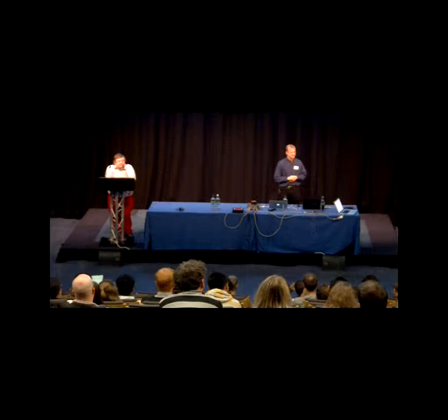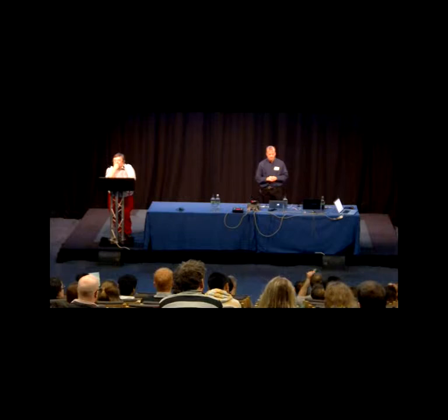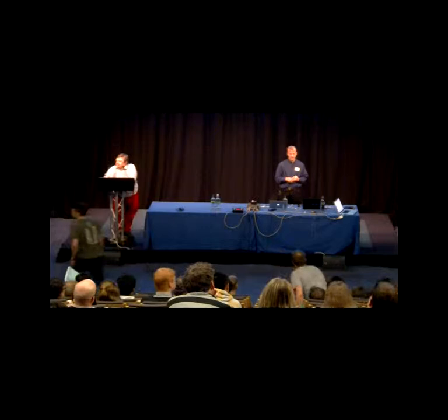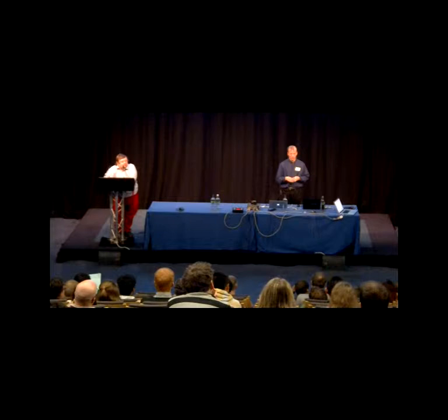Yes. Tim Grüne from Göttingen. In the first example you showed, there was a proline on the right-hand side of the screen, and the density looked as though the backbone was connected to the part that you morphed. So how do you know that your final model is not suffering from model bias and that you got the wrong backbone traced after the morphing? So model bias in the morphing process is a big concern, right? And that's why I spent so much time to try to get the least biased map possible. But there will always remain bias in those maps, and so it's hard to know for sure that you're not going to have some kind of problem like that.